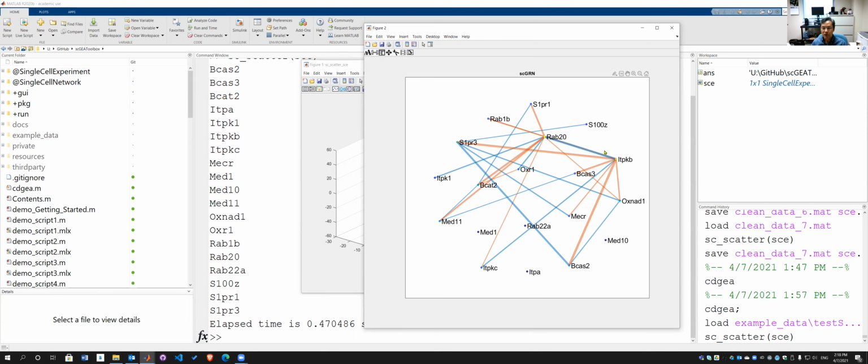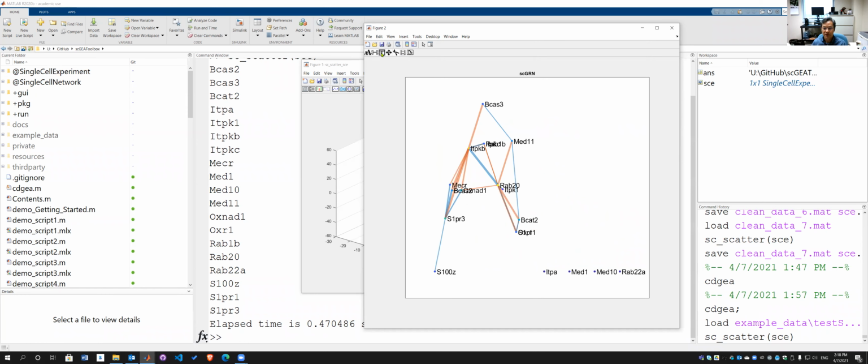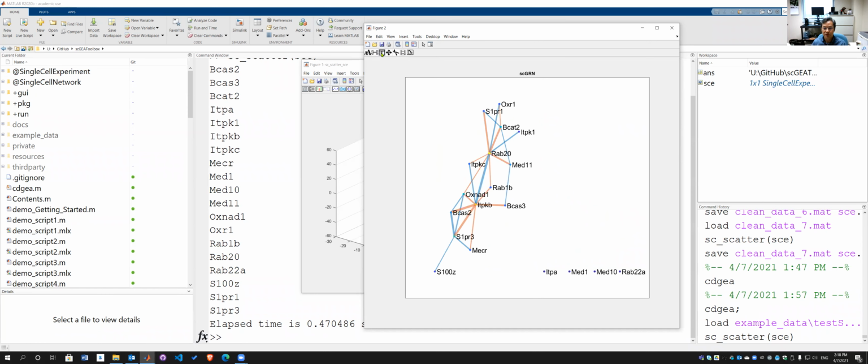Yeah, so I'm going to change the layout a little bit. So if you decide to click this button, you can see, okay, you want to rearrange the genes. These genes with no link to any other gene, so they are out of this connected module. And there are different ways to show this. Click.